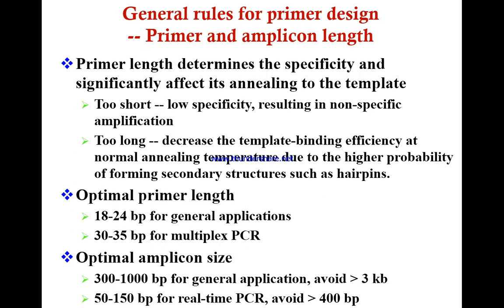General rules for primer design: primer and amplicon length. These are some rules which should be followed, and they apply to every primer which has to be designed.